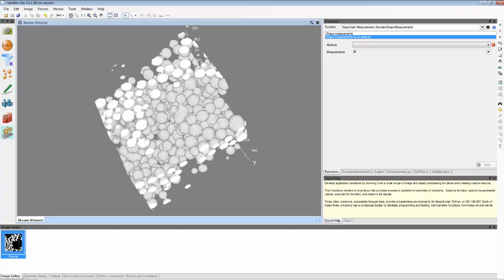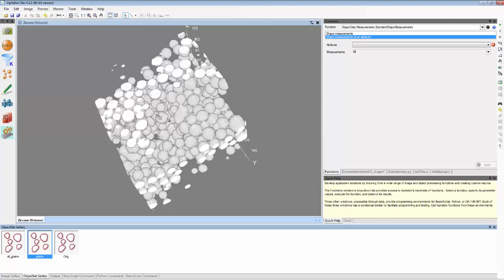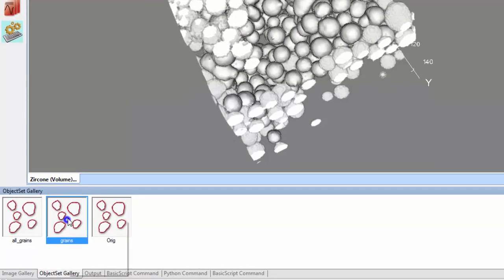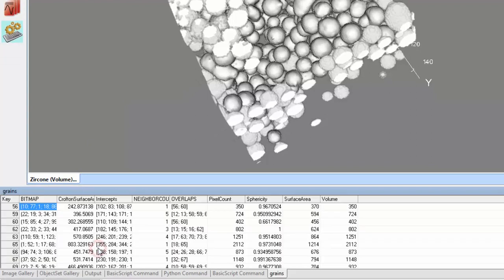The Aphelion macro creates an object set that can also be displayed by dragging it into the visualization window. The measured results can be viewed in tabular form.